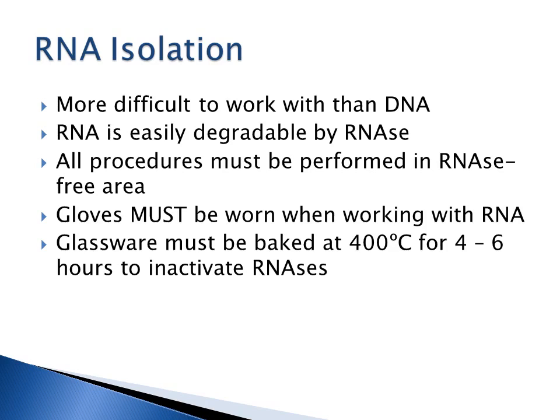RNA is very degradable. There are RNases everywhere. All around us are RNases. And so you're trying to isolate RNA and it's mixing with RNases that are everywhere, and before you can extract your RNA, it's already degraded.